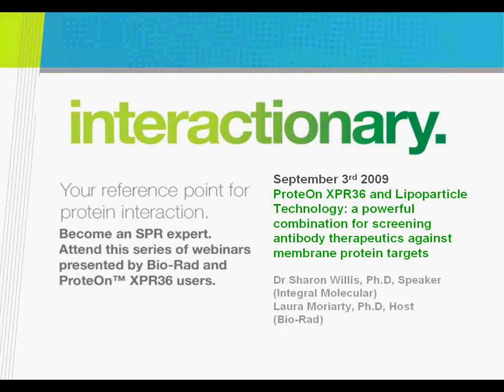So thank you, Ollie. Are there any other questions? I was wondering if Ollie would like to comment on non-specific binding with the alginate chips. Non-specific binding. Look, I may have seen it occasionally, but I would say it's no more than you would get with Biacore.